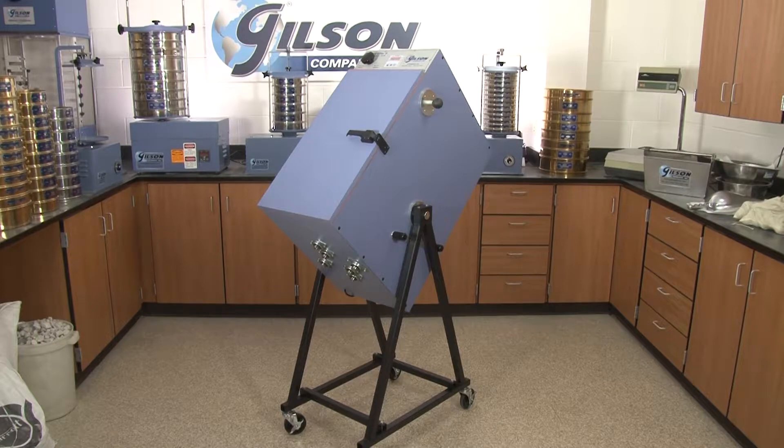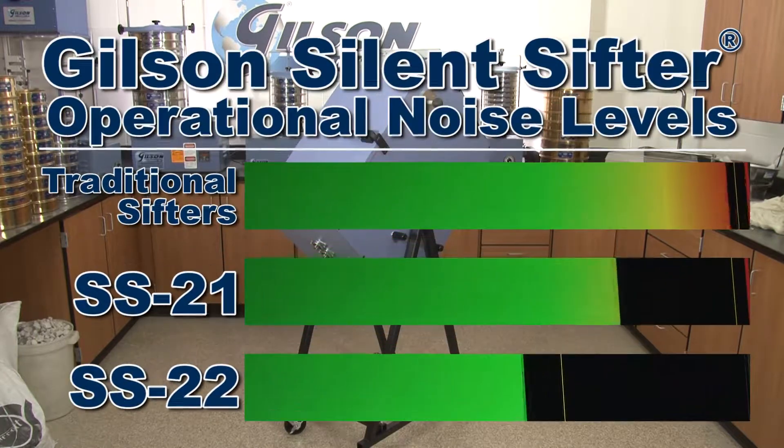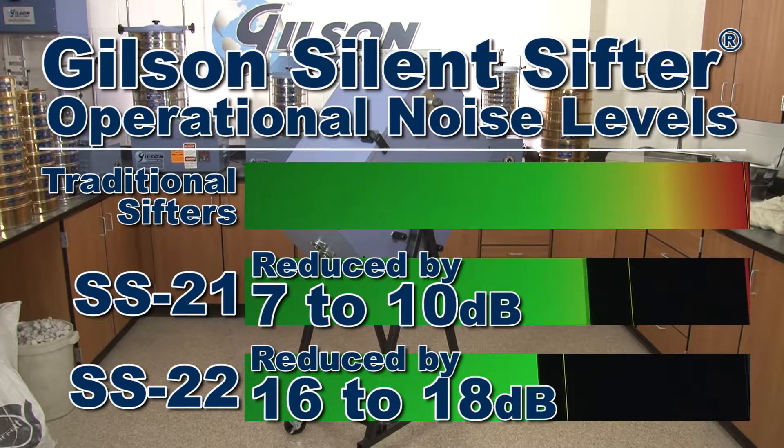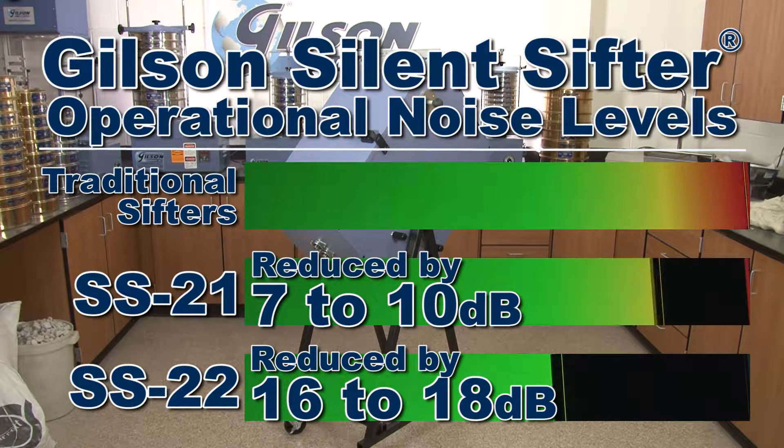The proprietary silencing technology used by the Gilson SS21 and SS22 silent sifter significantly reduces operational noise levels for enhanced worker protection and reduction of nuisance noise levels for your busy high production testing lab.